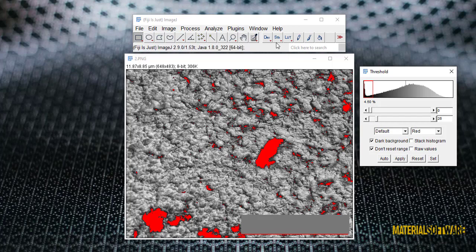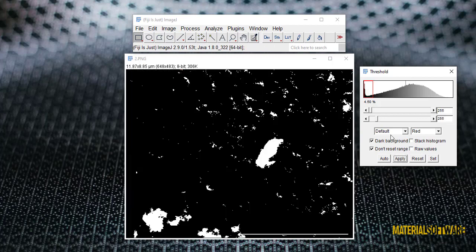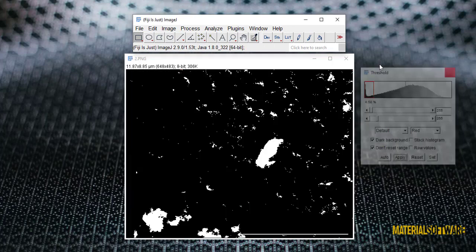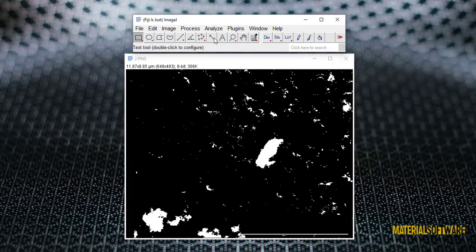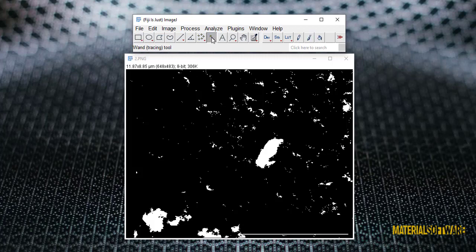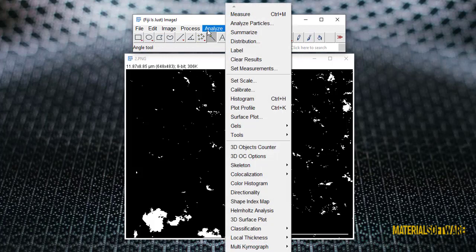Here, the point that I have to tell you is that if the border of your grains turns red along with the pores, you should use the brush tool to cut off the connection between the pores and the border of the grains. Now we select the apply option.